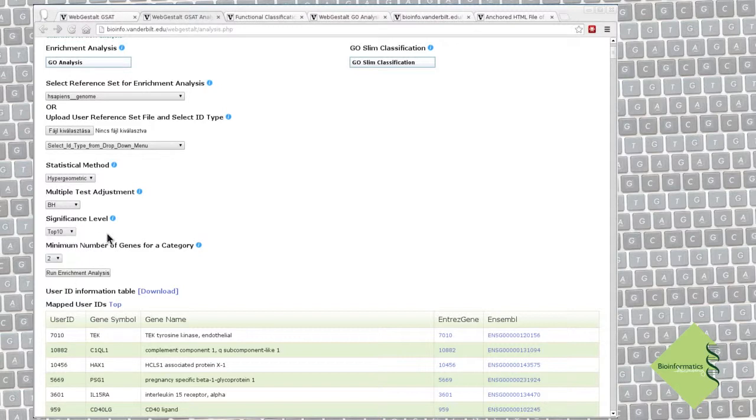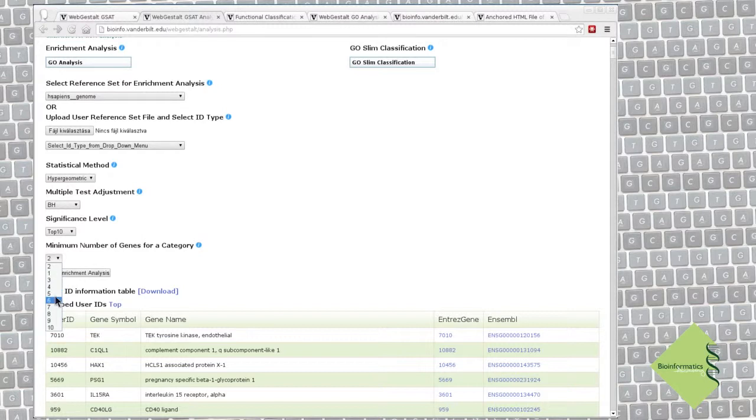I like to limit the minimum number of genes in the categories to something higher than the default, so we will skip too small categories. Let's use the threshold of 6 this time. Ok, we set everything, let's run the analysis.